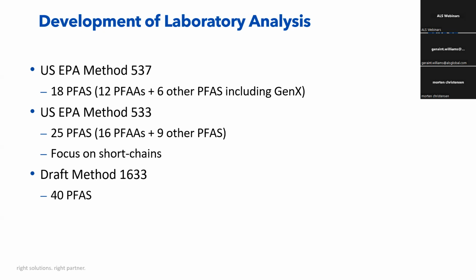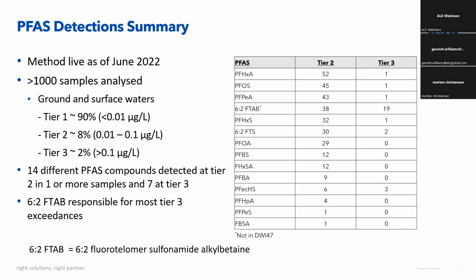You will see a difference between labs. You'll see a difference in the different approaches that are employed for TOP assay. I would point you to a useful review of TOP assay that was undertaken by Ventia, as well as the Australian Land and Groundwater Association, ALGA. They've looked at different approaches for TOP assay, and they've come up with the pros and cons of the different approaches. Other techniques have been reviewed, and there have been subsequent reviews carried out in other regions as well. But just as a point of note, we don't see the standardized approaches we see with other techniques.